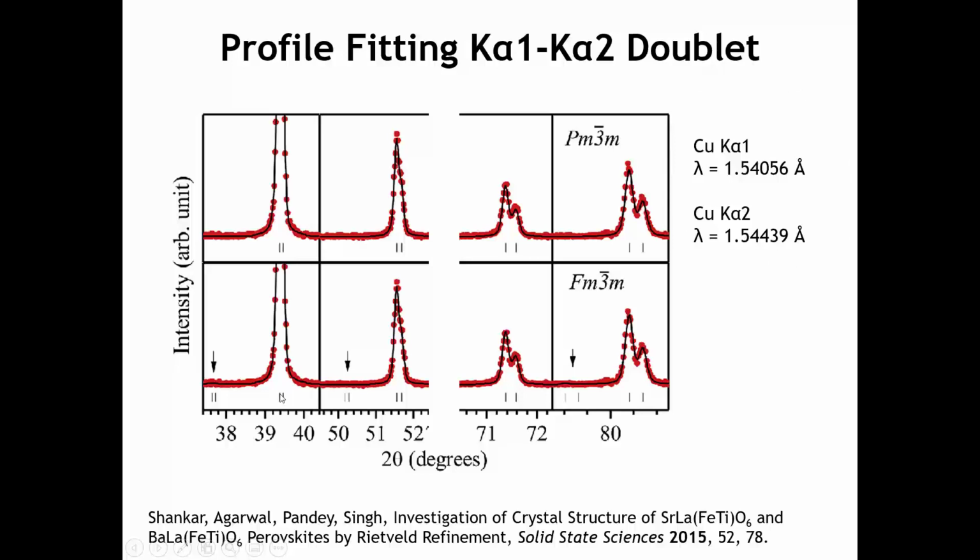You can see there's a black line where each of those 2 peaks should be found, and you can see that they're very close together. You get into an intermediate range, and there some splitting kind of occurs, but not really enough to resolve. And so this is throwing off where the peak maximum actually is. What we want to do in the auto-indexing is use the position of this first black line. And when you get out to yet higher angles, now you can actually clearly resolve the K-alpha 1 and the K-alpha 2 peaks. Here it actually would be somewhat easier just to pick the top of this first peak.